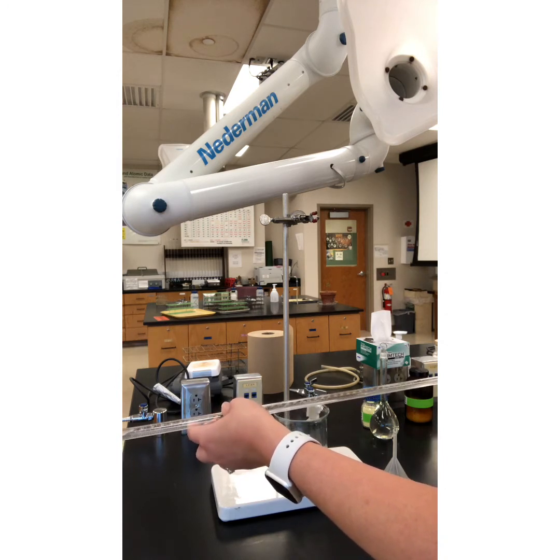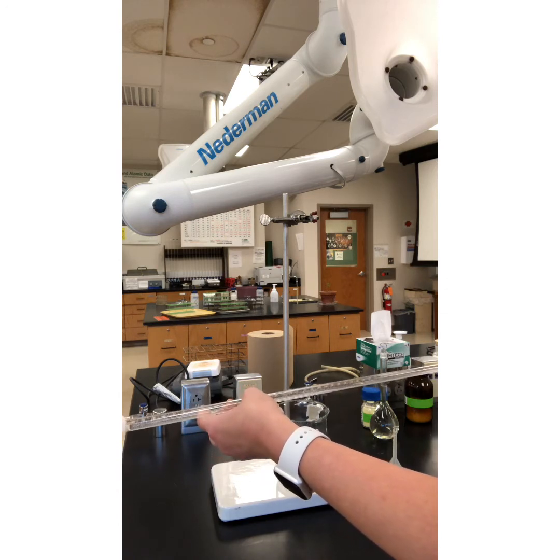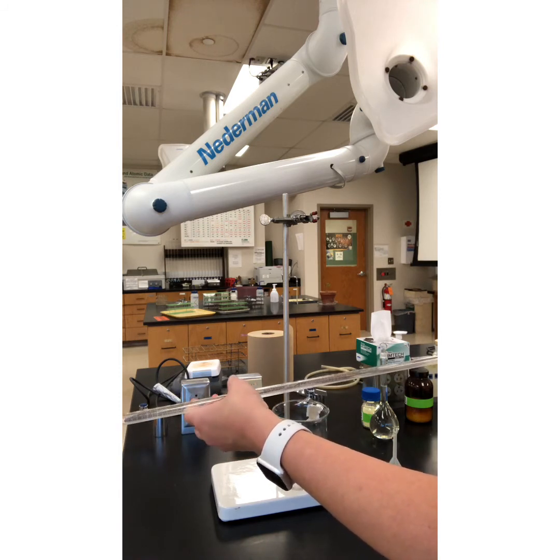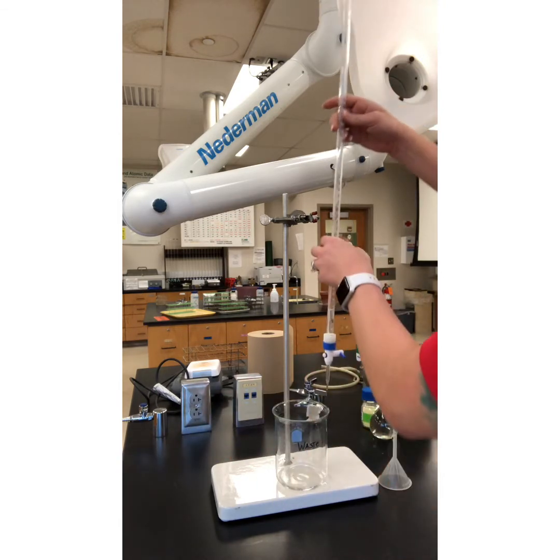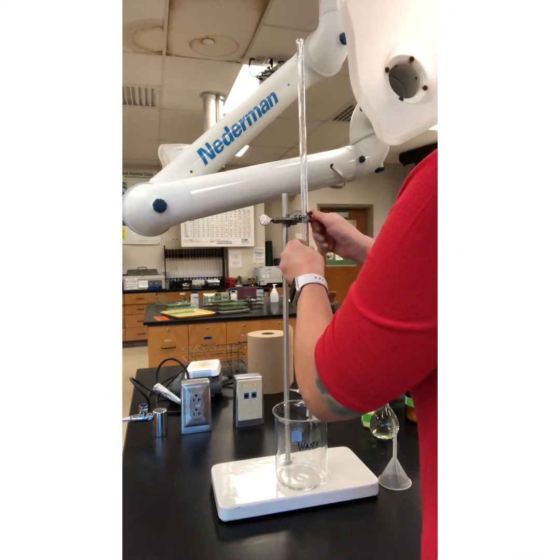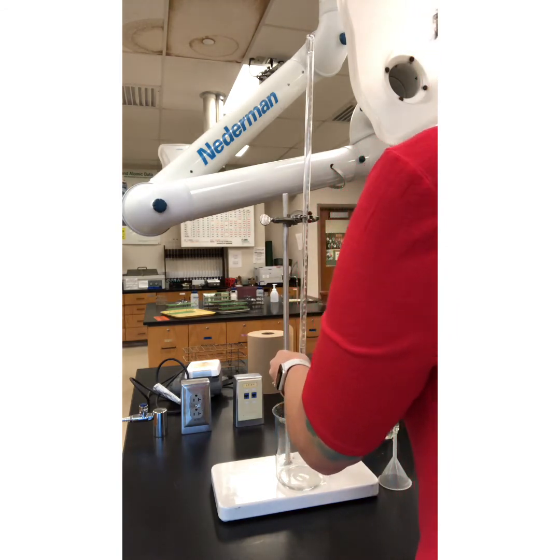Swirl it throughout the entire inside of the burette. Okay, just rinsing out the whole thing. Back in my clamp. And run it through. Get rid of that.